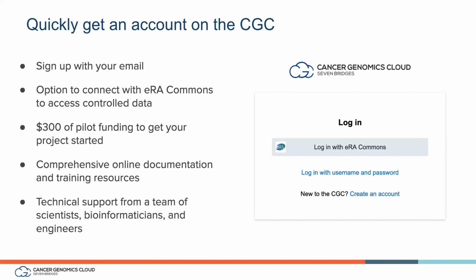All of the platforms also have a very rich set of tutorials and data to get users up and running on the platform. And everything is backed by a large team of technical support staff, as well as bioinformaticians and engineers.